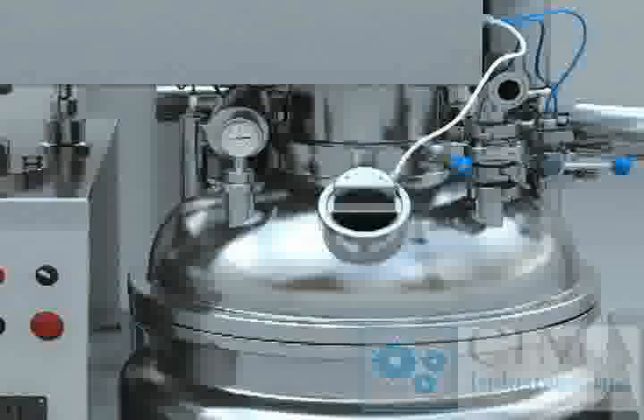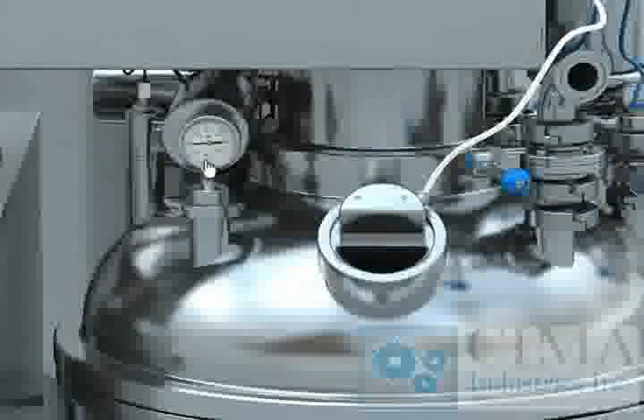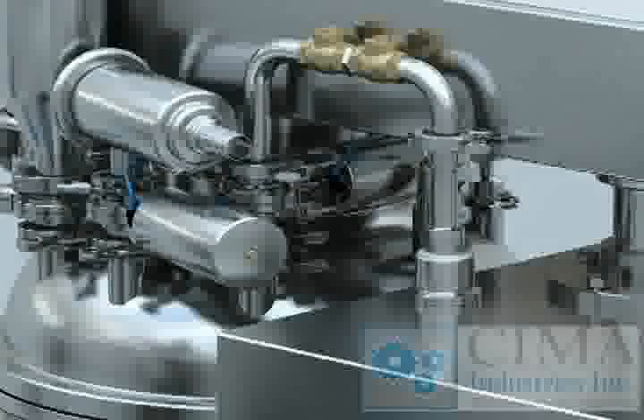On the upper ceiling head, there are a vacuum sensor, diagram vacuum meter, sight glass, CIP purge valve, pressure valve, respiration device, accessories feeding valve, liquid feeding valve, and automatic valve for vacuum.